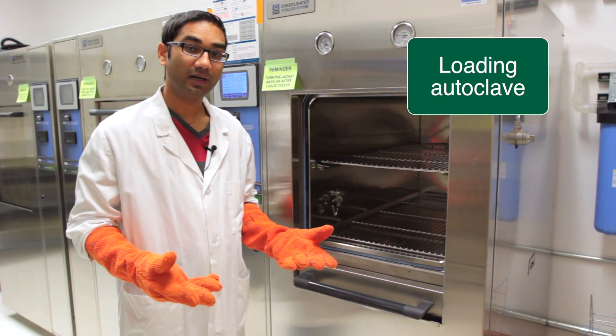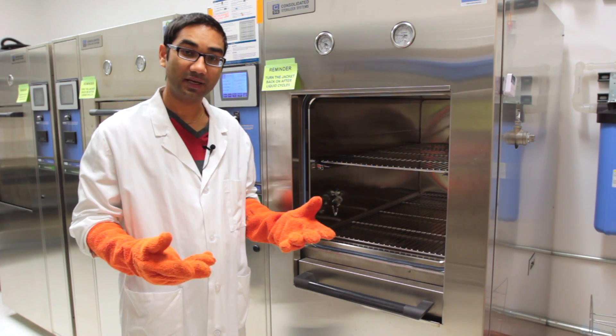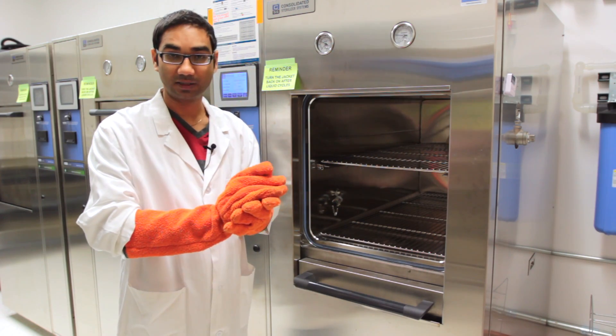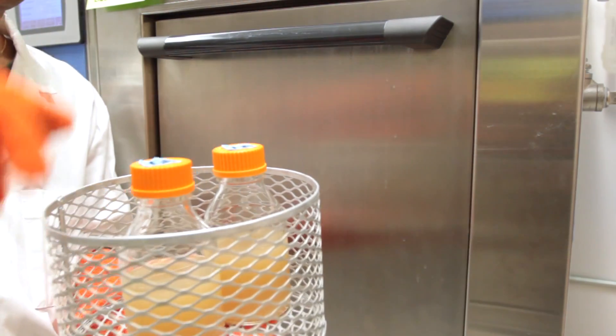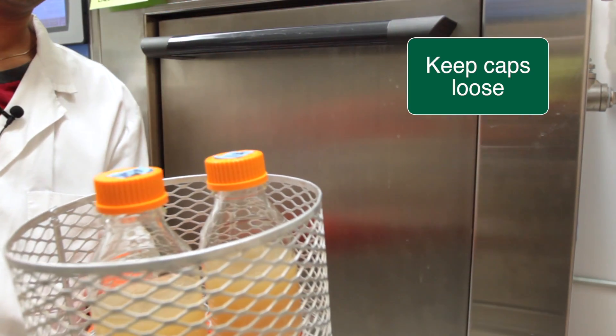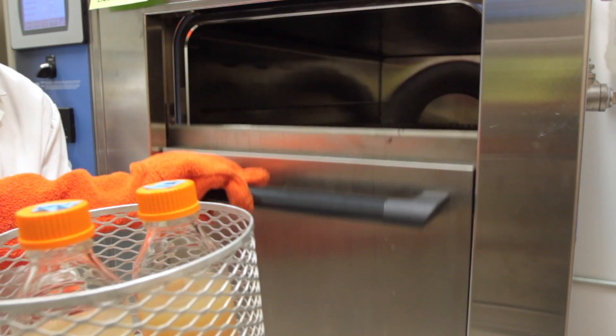When we are loading our materials and media into the autoclave, we need to make sure that we are loading safely. Make sure we are wearing long sleeve gloves. When our media is ready, we have to make sure that the caps are not very tight — they need to be loose so that when the media is boiling and steaming, there is some room for air or gas to come out.